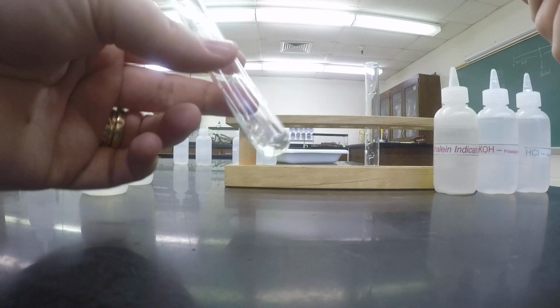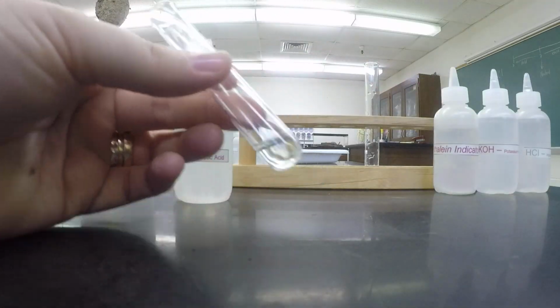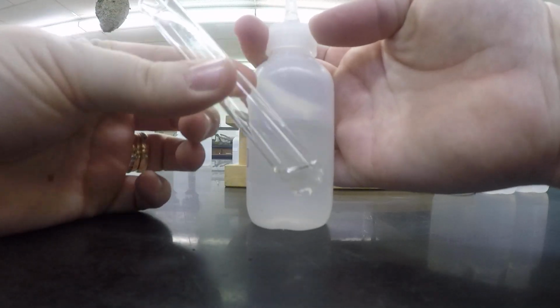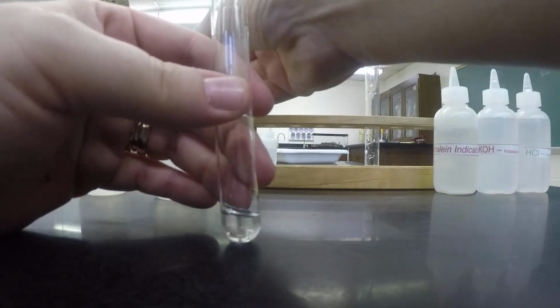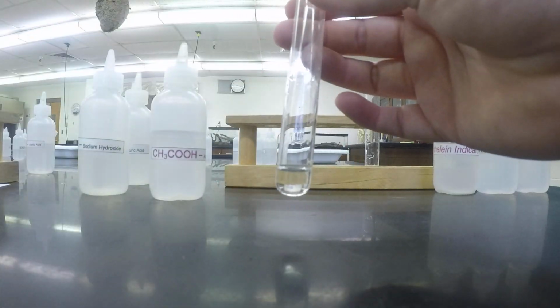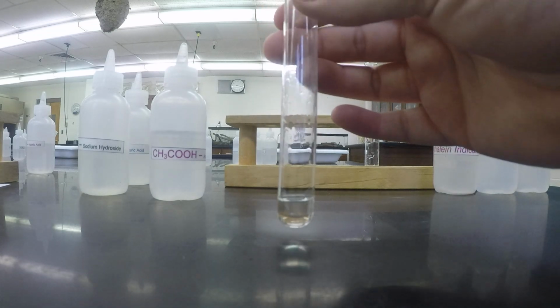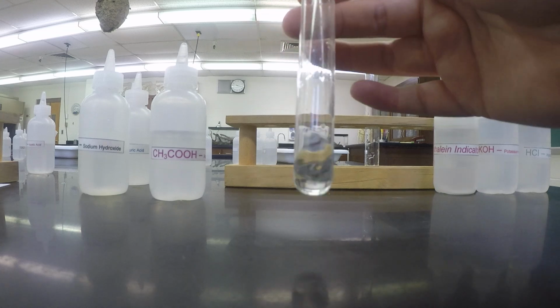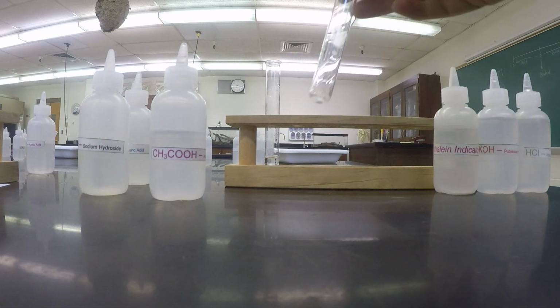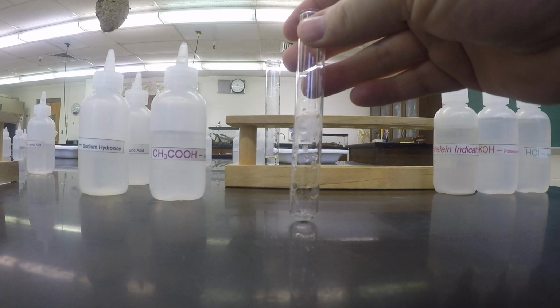6, 7. I didn't mean to do that, but so can you see the complete color change? Look at that. No longer green, it's clear. So it took me 7 drops to go from green to clear. So our initial color was green, our final color is clear, and how many drops did it take us to get to that? Okay.